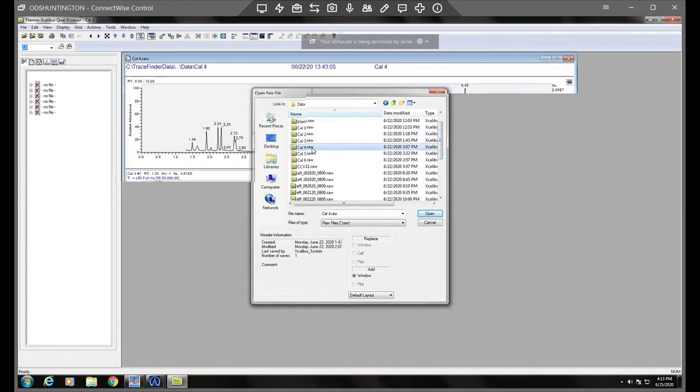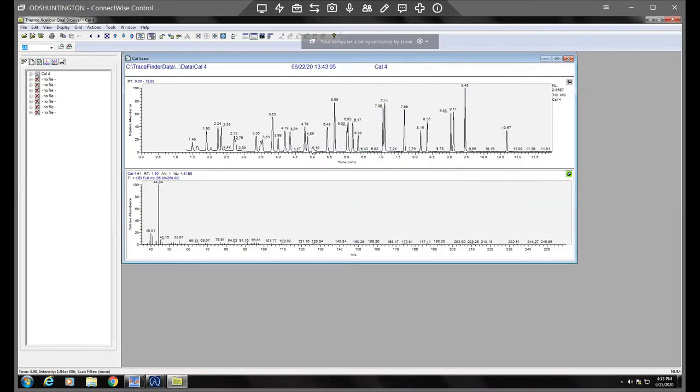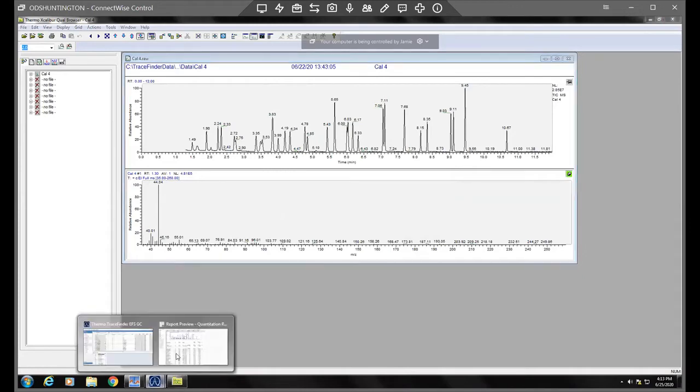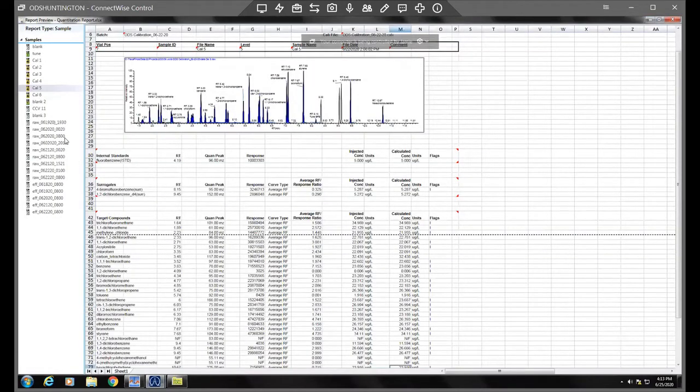So anyway, I was just going to pull up one of these calibration files they ran. Let's just pull one up here. So actually I can pull up the quantitation report still, so I can still use trace finder at the same time.